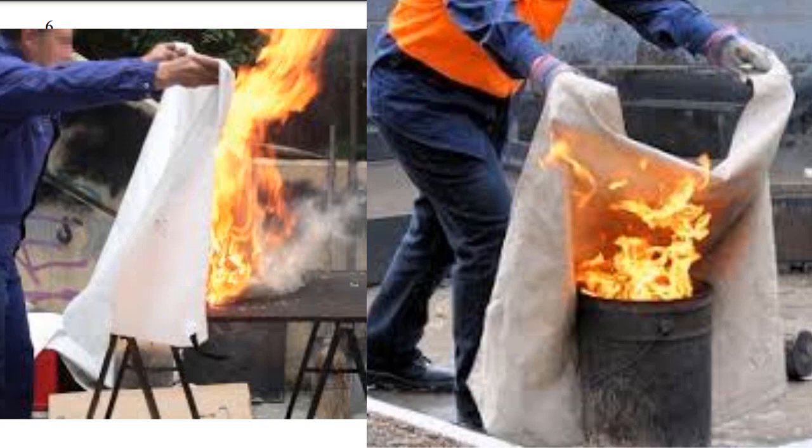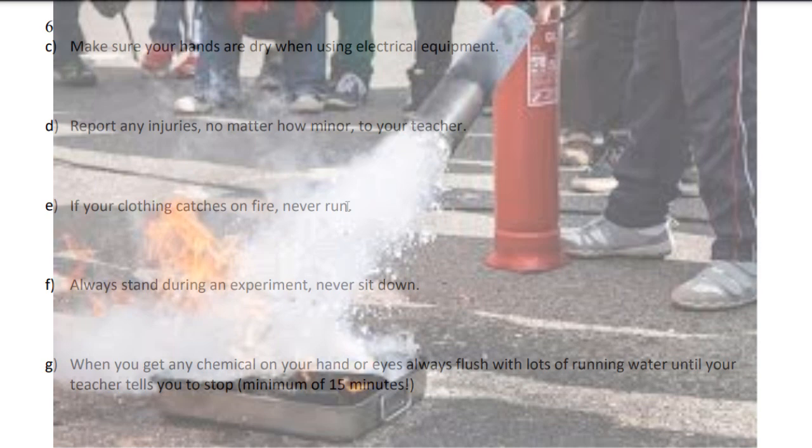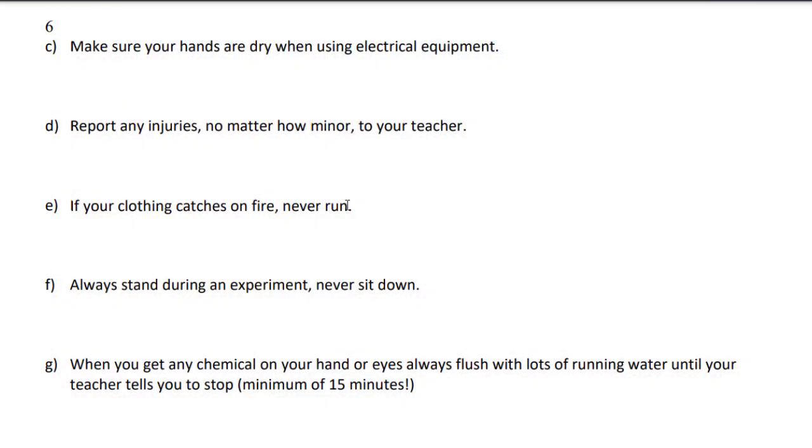Fire blanket will do the same thing. You can throw it over top. And then a fire extinguisher has a chemical on the inside that will do the same thing again. It'll smother the fire. What it does is it separates the fuel from the oxygen itself so that you can choke out the fire. You may not be able to do anything about the heat. Sometimes you can cool it down. Water cools down fires. That's why they shut off. Plus, water also will block, because they now have a layer of water, you might separate the fuel from the oxygen and turn off the fire that way. So yeah, stop, drop, and roll, never run around. And again, this is one of those easy test questions that I'm sure you guys will get perfect on.